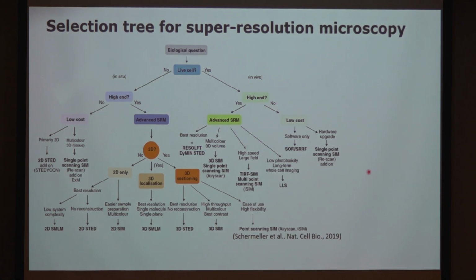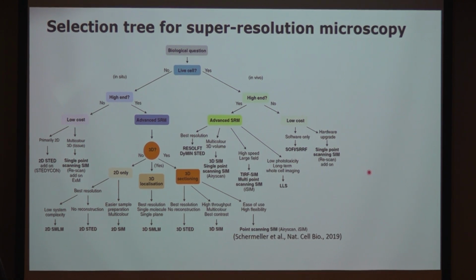Yeah, so there are a lot of different options for you. But the problem with super resolution microscopy is that for the most part, you need to buy very expensive equipment, right? And imagine that even if you have the best super resolution microscope, in a few years a next generation might be invented, and do you have the money to buy the newest, best thing, right? That will be a problem for smaller institutes or labs that don't have a lot of funding, such as my lab, right?